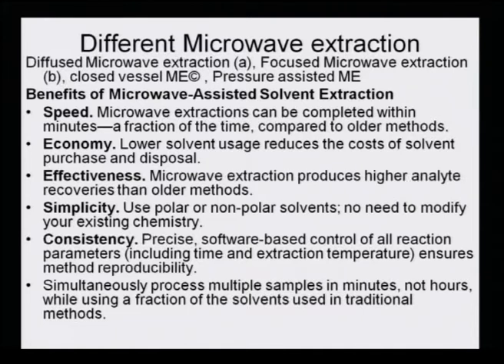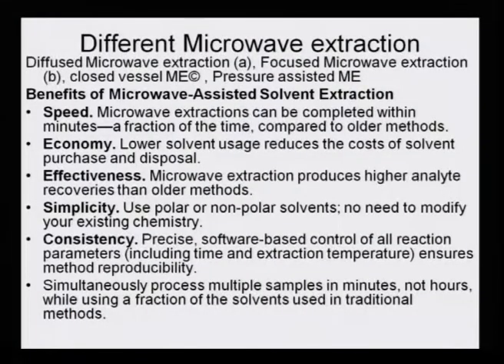Different microwave extraction. Now, a little while ago I had told you about microwave extraction, but I forgot to mention that there are different modules. I am just briefly mentioning these here in order to keep you aware that it is not just one model that is proposed for microwave extraction. There is a model called diffused microwave extraction, and there is another model which is called focused microwave extraction. There is a third model which is closed vessel microwave extraction, and there is a fourth model which is pressure assisted microwave extraction.